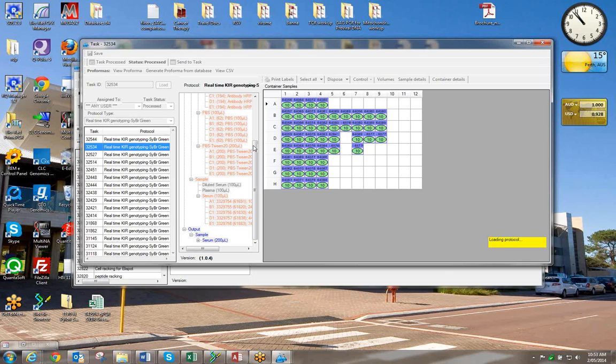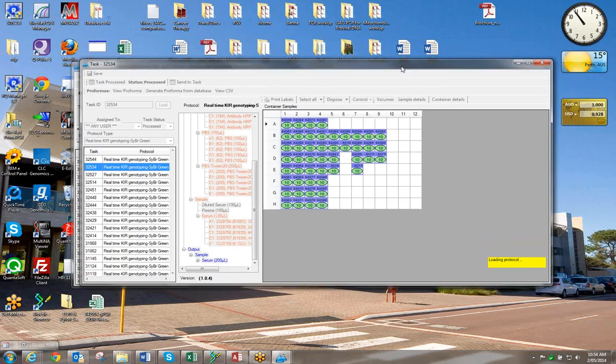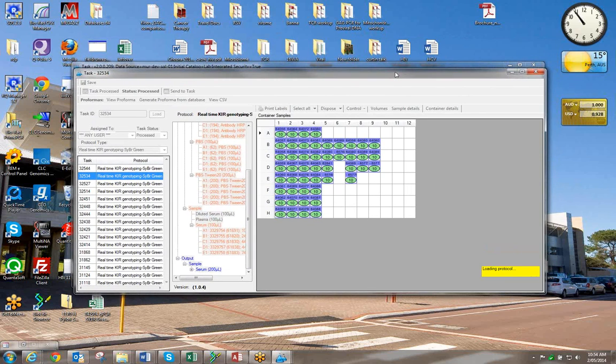Look, I think these are something you all can have a look at. I don't really need to show you. You should be able to see the CSV files there, but I'll try and fix it up so when you all come in tomorrow, you should have these things working. I think you've got a big idea of what this is. For some reason, it's gone very slow, and I don't know how I can fix it now. I wouldn't bore you with that.